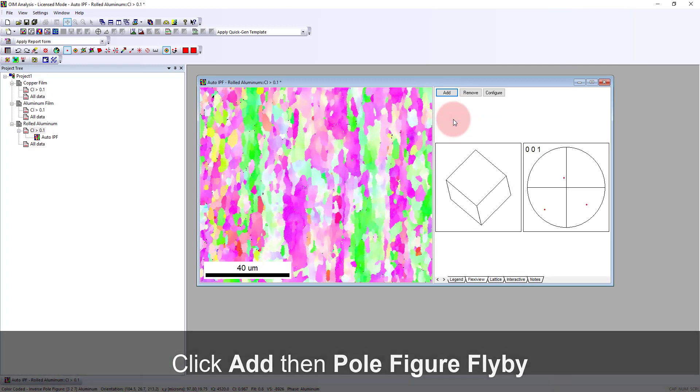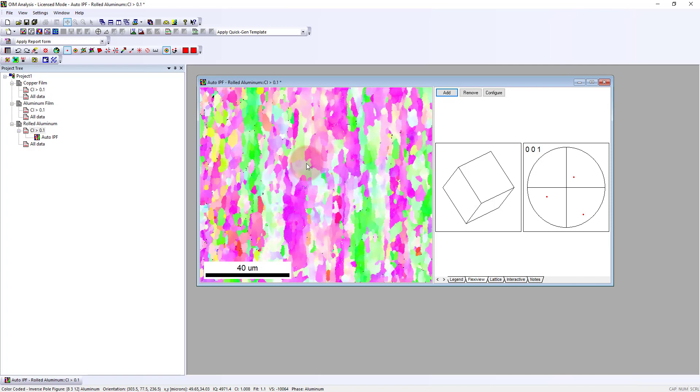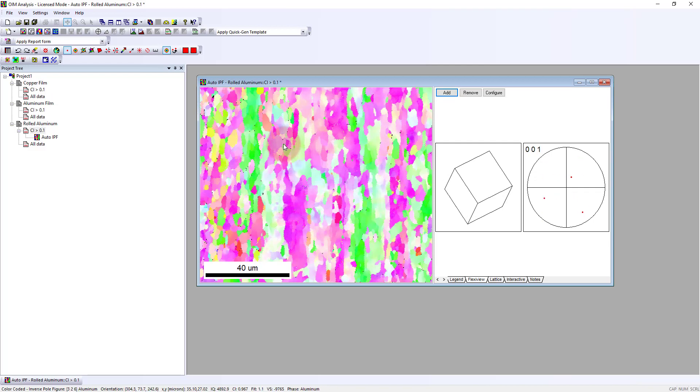The pole figure shows the projection of the different poles from different planes onto a 2D projection of a sphere. So that's what we see here with the 001 pole figure, and each face of the crystal is projecting. If we look down here, this grain would be the point in the bottom right of the pole figure, the other faces in the bottom left, and then the top face is pointing kind of the top line aligned in the middle. As we look at different grains, we see how those poles move.